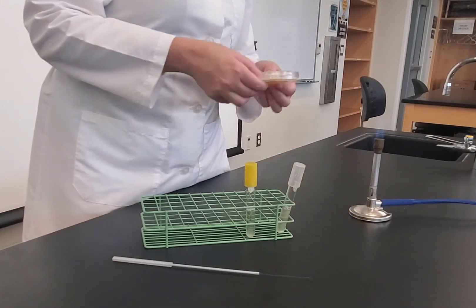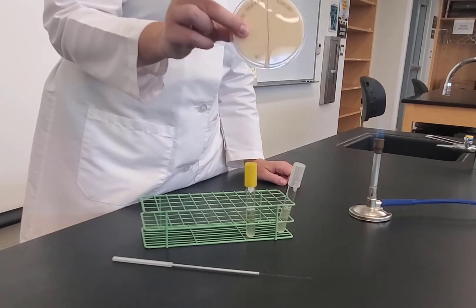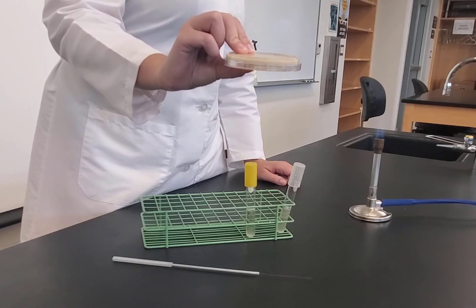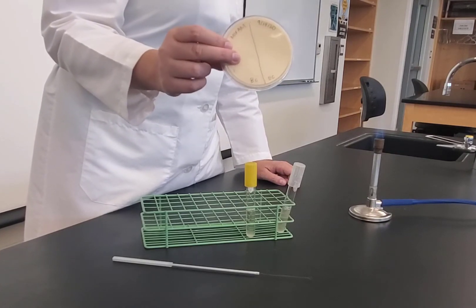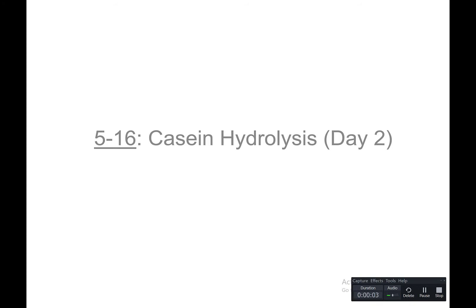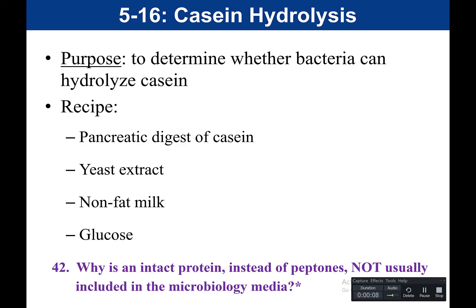The skim milk agar is now inoculated with both bacteria. Place the plate in the incubator agar side up. Next time, we'll examine the plate to see if casein was hydrolyzed — if the milk was broken down. Now we move to Day 2 of casein hydrolysis to discuss the readout. The purpose of this test is to determine whether bacteria can hydrolyze casein, a big bulky milk protein that makes milk cloudy white.